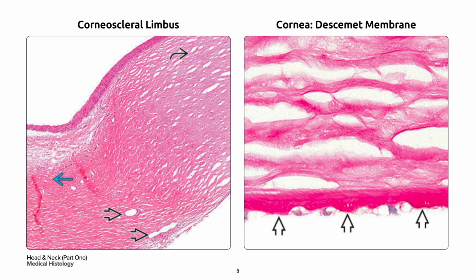On your right are normal age-related changes seen in the Descemet membrane, consisting of focal thickenings in the bold black arrow. We call them Hassall-Henle warts, which appear to alternate with the posterior endothelium, pointed out here in the bold black arrow.